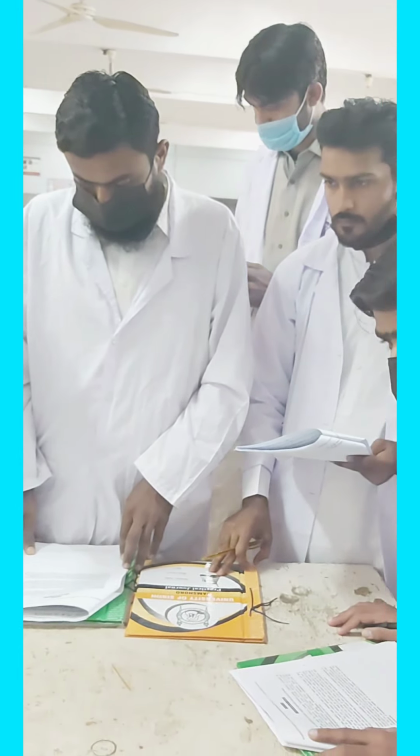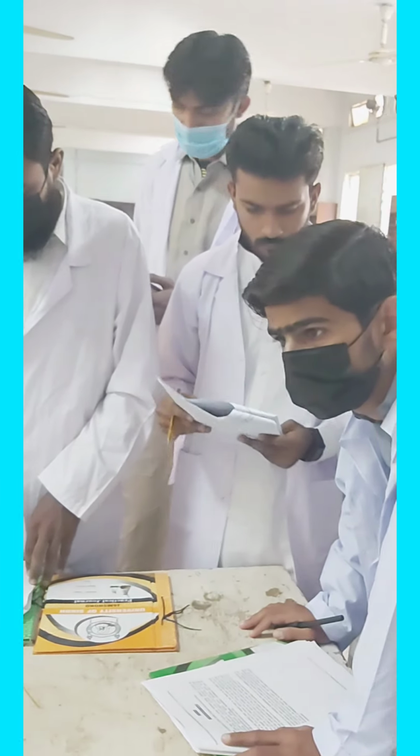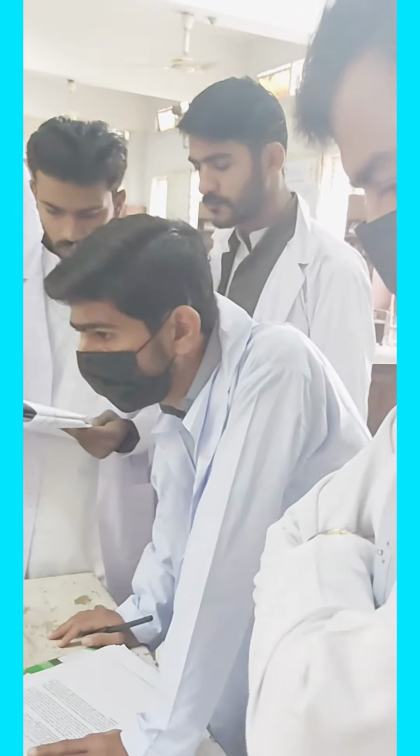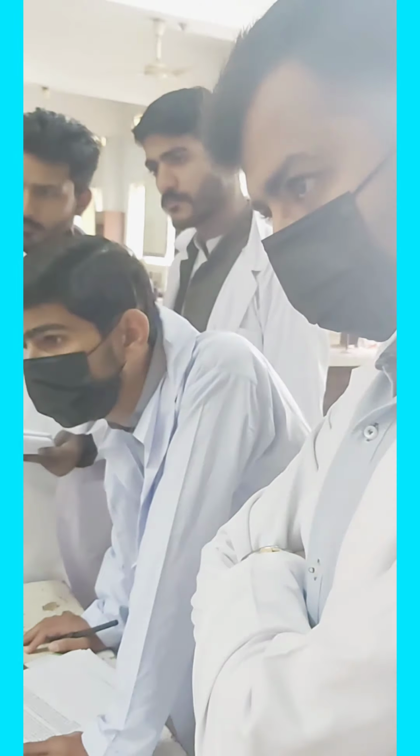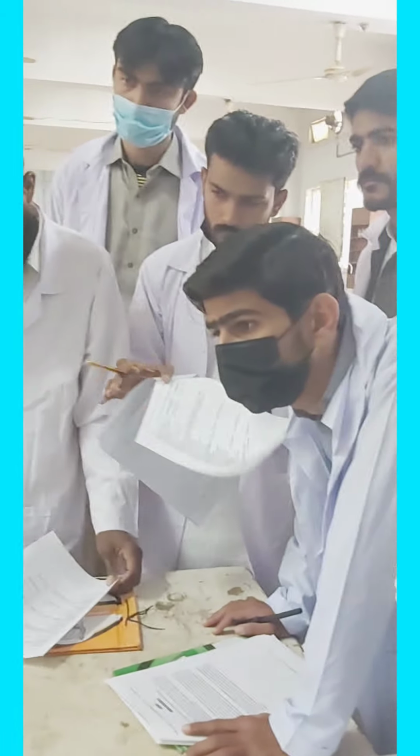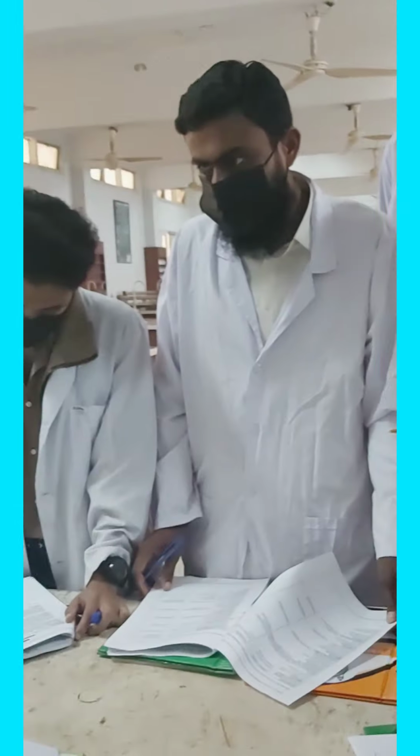So now they are saying something very important, that you should plan carefully what chemical tests to use based on the results you have obtained so far. What does that mean? It means that now you are on step number 3. In the previous 2 steps, you have collected some data. Number 1 was your first step, in which you did the preliminary examination. Though it's a known compound, you still have the data on its physical properties.